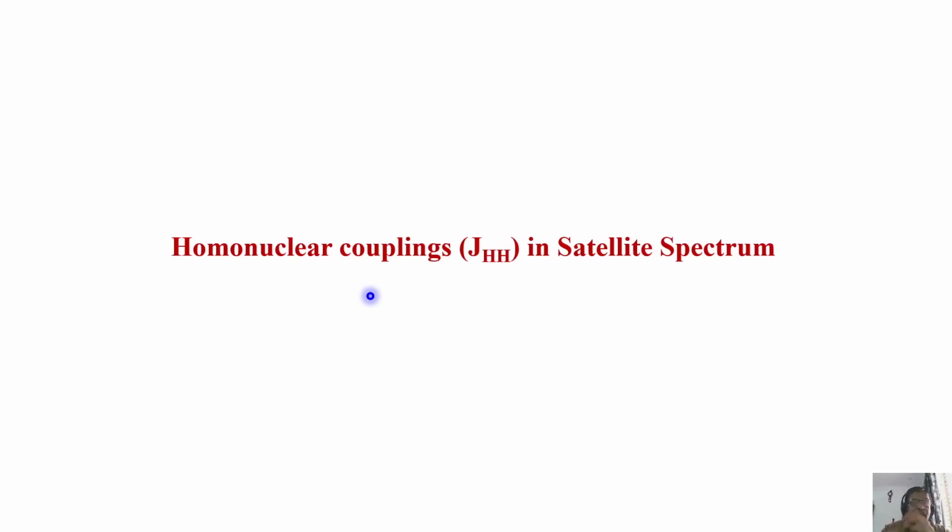I'll tell you, if I analyze the satellite spectrum, some information which you cannot get in the proton spectrum will be obtained. And we did solve this in one example. I don't know whether you remember, in the spin system analysis of AA prime X coupled spin system, using Pople nomenclature, I showed you how to distinguish cis and trans isomers.